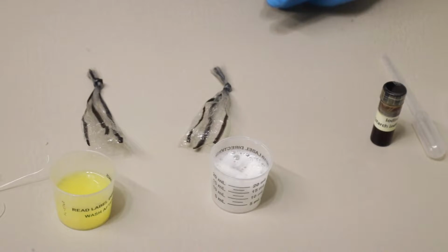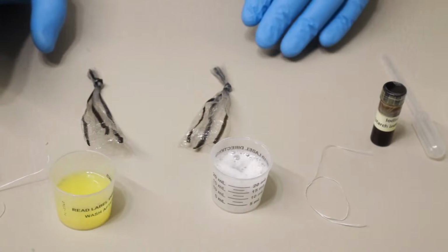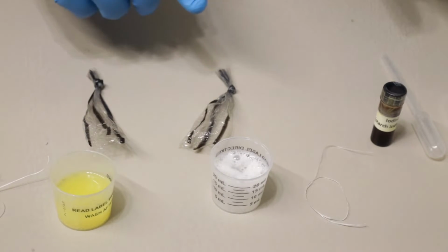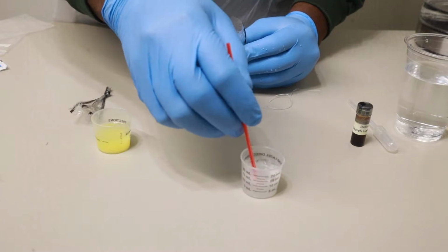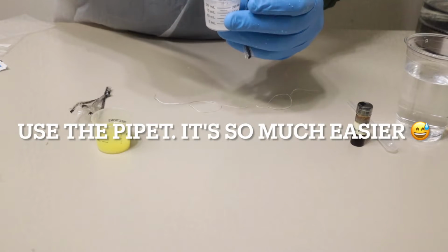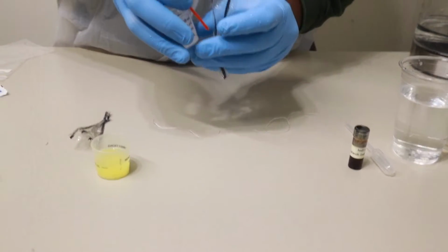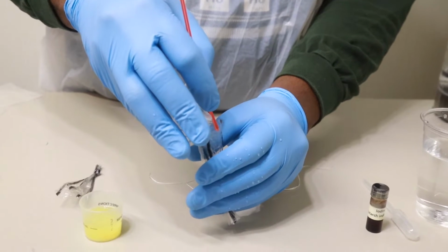So I have one knot there, I have another knot there. Okay, so we have 2 knots. Another way to do this, if you have a paper clip, you might want to try clipping it to the side of the cup. So I'm about to pour in the starch solution, so just be careful not to pour any on the sides. I'm going to try and use this technique where you have something on the outer edge and it'll pour along the edge.